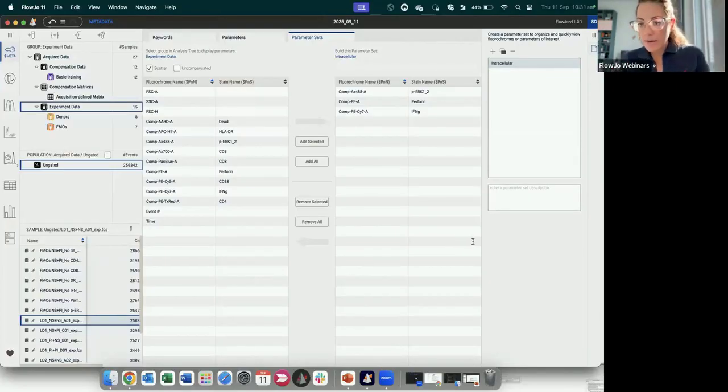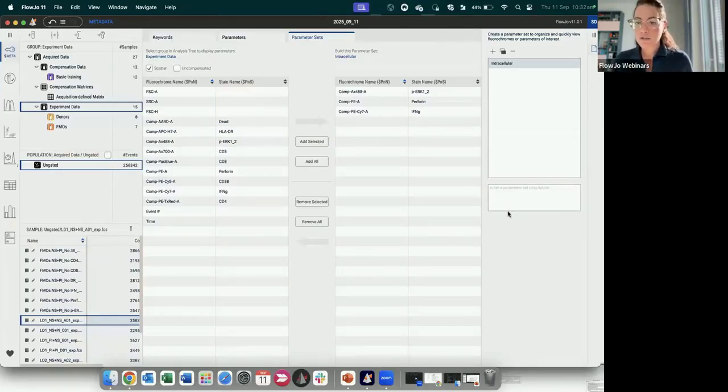And then the last question I have is, I may have missed it, can FlowJo v11 open workspaces from older FlowJo versions? Not this version. So you cannot open a v10 workspace into v11 at the moment, but it will come. This is the first priority, the first request that we have. So we're working on it, just give us a little time. And we release frequent updates of FlowJo, so just look out for it.